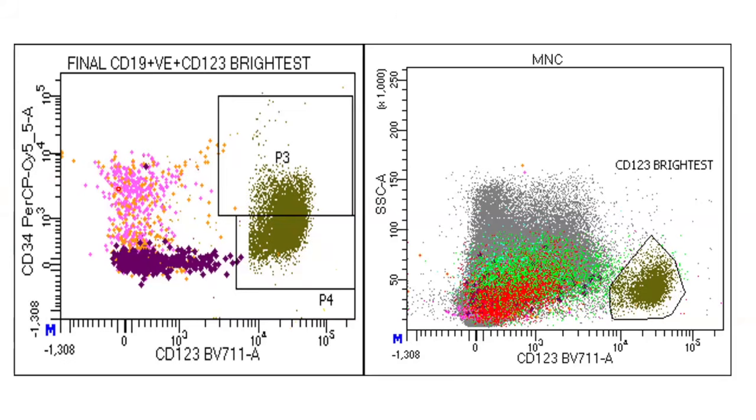So basically, stage 1 hematogones, as we already know, the pink ones are stage 1 hematogones. They're not at all showing any CD123. This is the CD123 normal expression, and this is completely negative CD123 expression. So basically, these are negative for CD123 on stage 1 and stage 2 and stage 3 hematogones. None of them are showing CD123 expression. If the cells were present over here, then they would have been positive for CD123 or close to CD123 expression, or even over here, if they were present, they could have been bright expression of CD123, which we are not seeing over here. So these are normal hematogones that we are seeing.